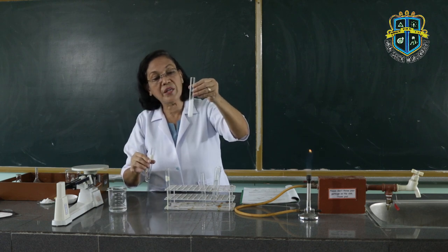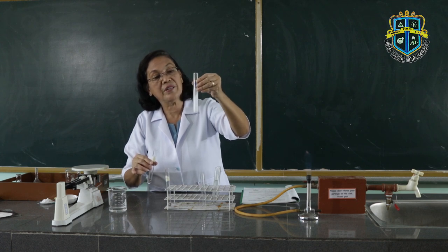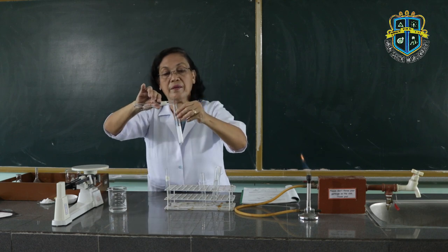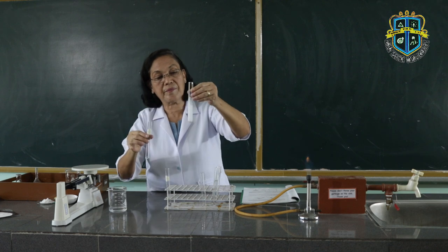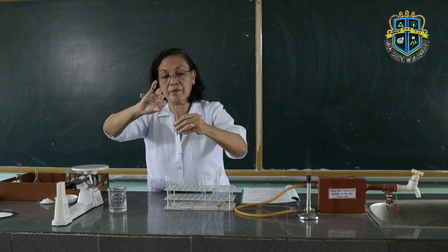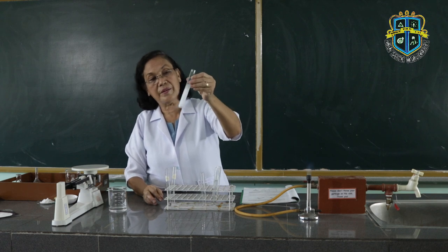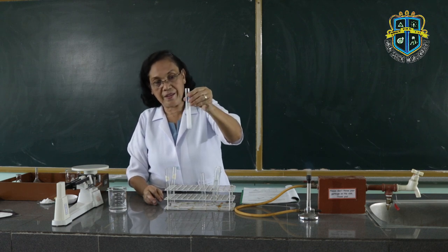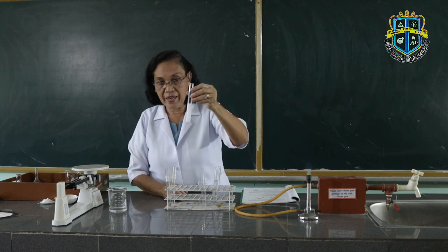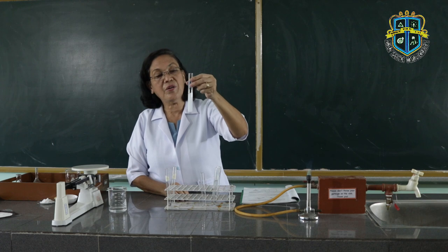We add more sodium chloride to make sure that all the silver chloride has been precipitated out. Since no more further precipitation has been observed, we let this mixture settle.